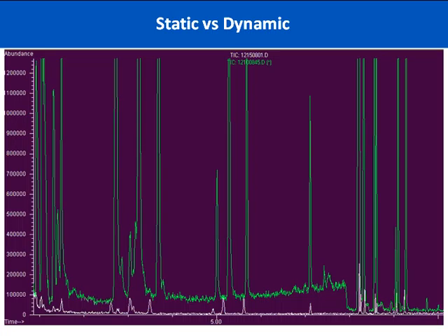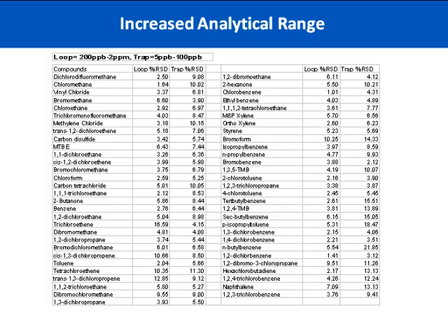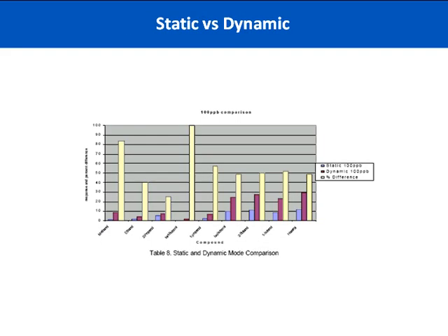Here's a typical analysis run for some VOCs shown as an overlay of chromatography comparing static and dynamic. Notice the response is much greater using the dynamic mode, represented in the green chromatogram, than in the white chromatogram which is your static mode analysis. Here's a nice table showing both loop and trap for some common VOCs. The percent RSDs are really nice for both. But the loop is looking at 200 ppb to 2 ppm, while in the trap mode we're looking at 5 to 100 ppb. Both RSDs are acceptable and very tight, but the levels of detection are much lower in the trap mode.